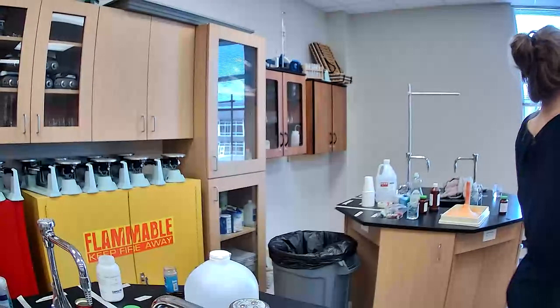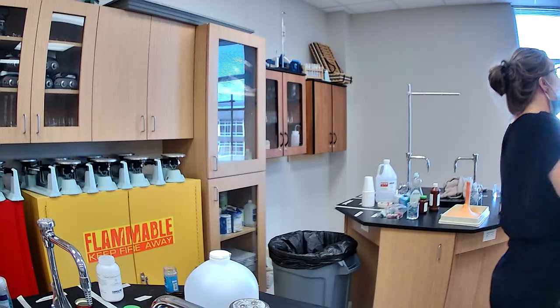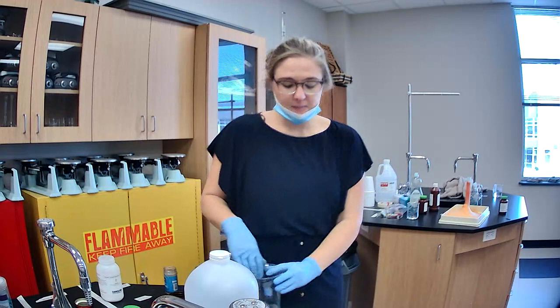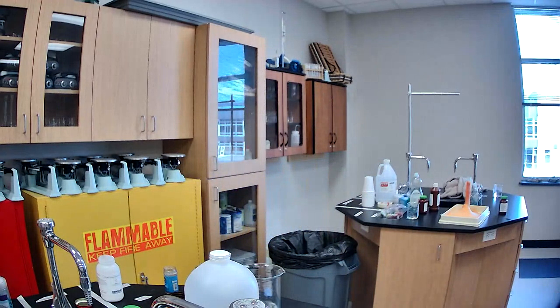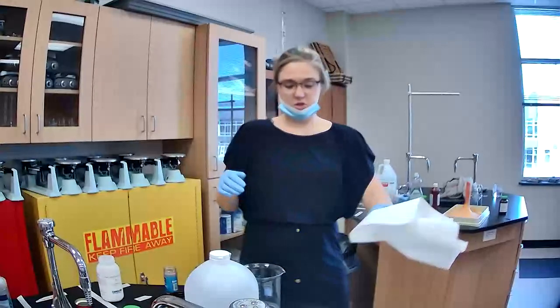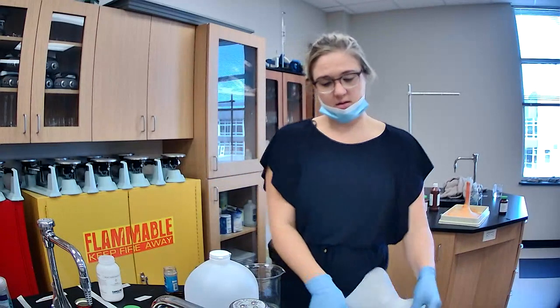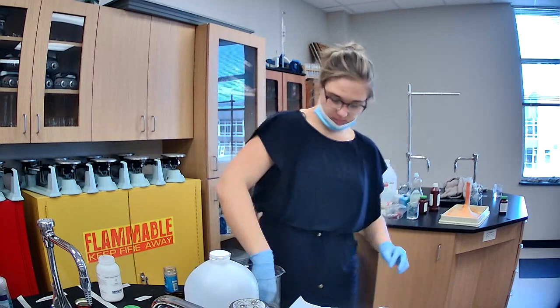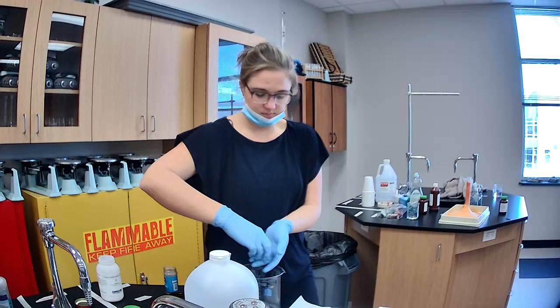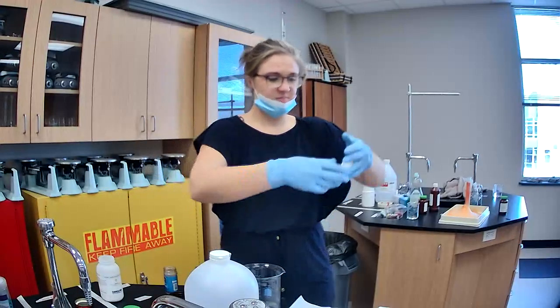Oh my god. Now, I can't put the air pockets back into it, so I can't get the foam back. But I am going to take it out of the acetone, and we'll put it on this paper towel and see if we can get it to dry out a little bit. And hopefully it'll make a different shape. I'll let y'all touch it when it dries a little bit.